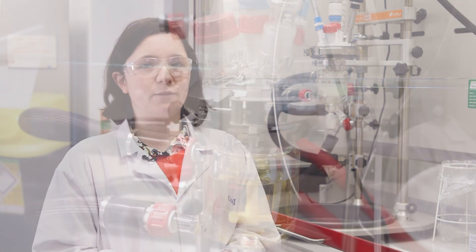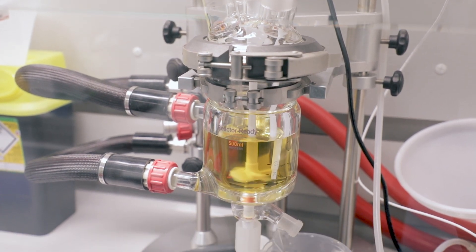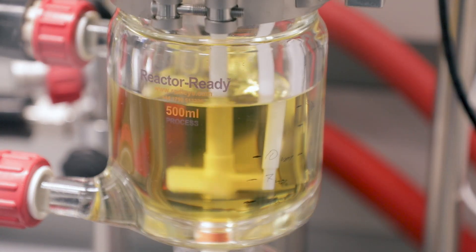When we use the reactive readies, this would typically be when we have developed a process and we're starting to get into the phase where we really want to see how that behaves on a certain scale, how it behaves in a fixed vessel — thinking about going to plant in the future for the customer. The reactive readies are really invaluable for that kind of work because it's a really good scaled-down model of what things will look like on the big scale, and the fact that we can interchange the sizes makes it a lot easier.